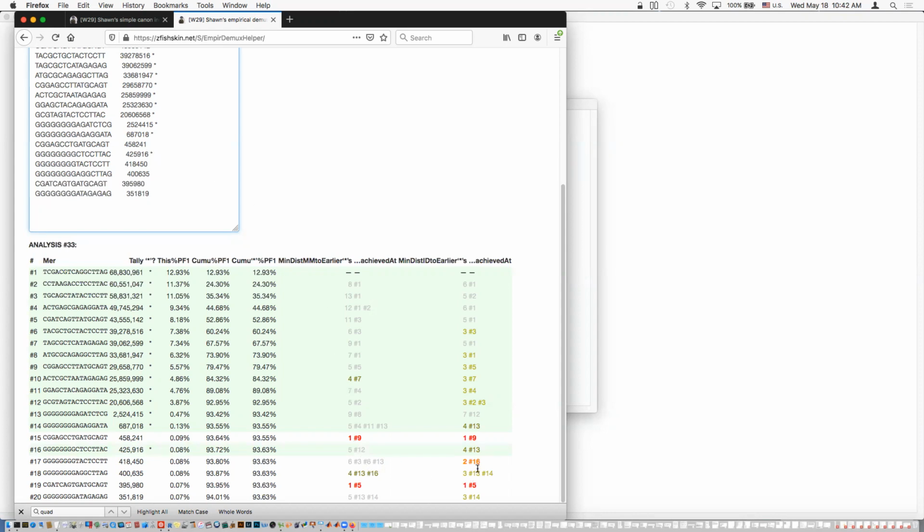Then the next one, two mismatches. Two indels is pretty big. It is 6 mismatches away, which are much more likely than indels anyway. So one indel, yeah, okay, maybe two indels is like a rare multiplier versus the 6 here. Yeah, I don't know. I mean, at this point, we are petering down, and maybe we do need the full analysis to really make more intelligent decisions at this point.